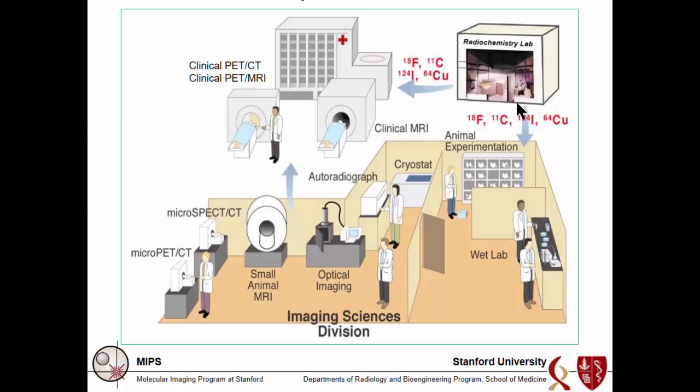So as a radiochemistry lab, we have to keep this in mind as we make these various tracers, whether we wear our two hats, as a commercial lab or our academic lab at Stanford, we can provide clinical grade radiotracers to feed into our clinical PET CT program as well as our clinical PET MR program.